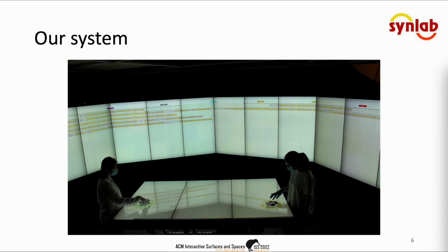Tangible Chromatin includes three main components: an interactive tabletop display, 48 inches by 81 inches, a large interactive wall display, 48 inches by 324 inches, and one or more mobile phones that serve as active tangibles. We use tangible and multi-touch interactions on the tabletop for browsing and selecting data elements across multiple experimental conditions, and pair these with a broad, explicit overview of the selected data on the wall.